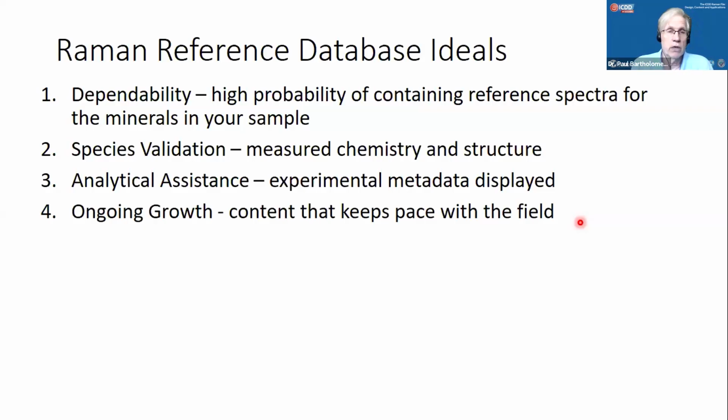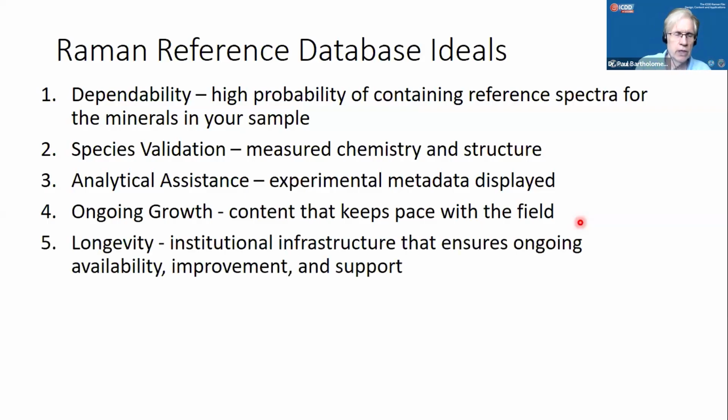Ideally, ongoing growth so that it does become representative of all the possibilities and even keeps pace with growth in the field. And of course, longevity. You don't want to be using a database and being dependent on it and having it disappear in 5 years. And you want ongoing support for data quality improvement and so on.